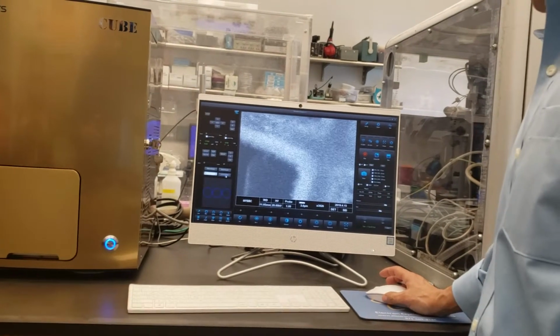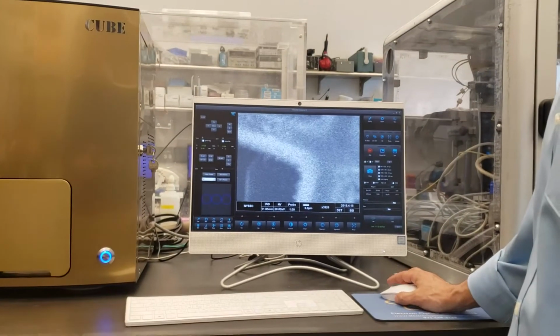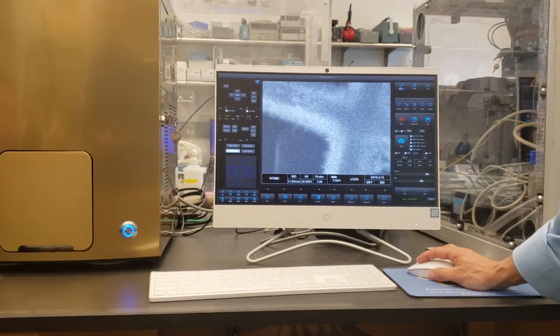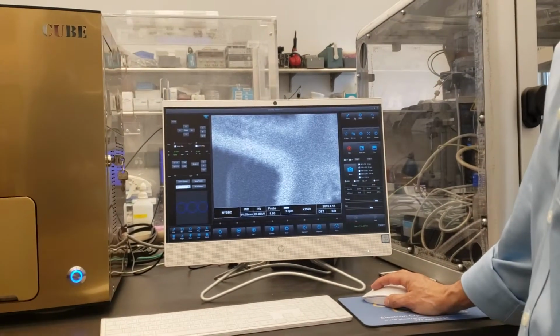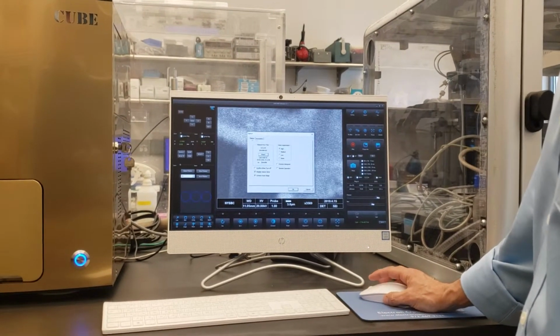So again, the stage program, right? But the carousel, this is the easiest way to pick wherever you want to go. All right, so if we skip around just a little bit, I'm going to come over here. This is a configuration file, and that's for us to go in and change some parameters. It's password protected, so you really can't go in there. And then here you have an option where you could add text and annotation, and so on and so forth.